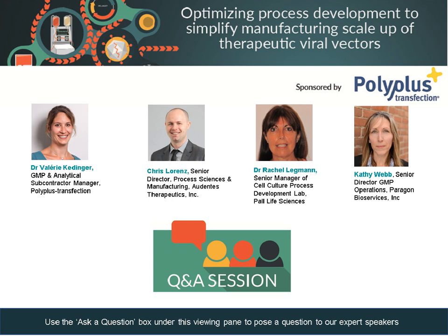That's a great question. Candidly, I think this is one area where we need probably more analytics or more development to understand how well the complex that we're forming is getting into the cells. Is it getting into all the cells equally? Is it getting into some cells more efficiently than others? And the productivity is therefore variable from cell to cell within your cell culture. These are obviously very, very challenging things to monitor in real time.